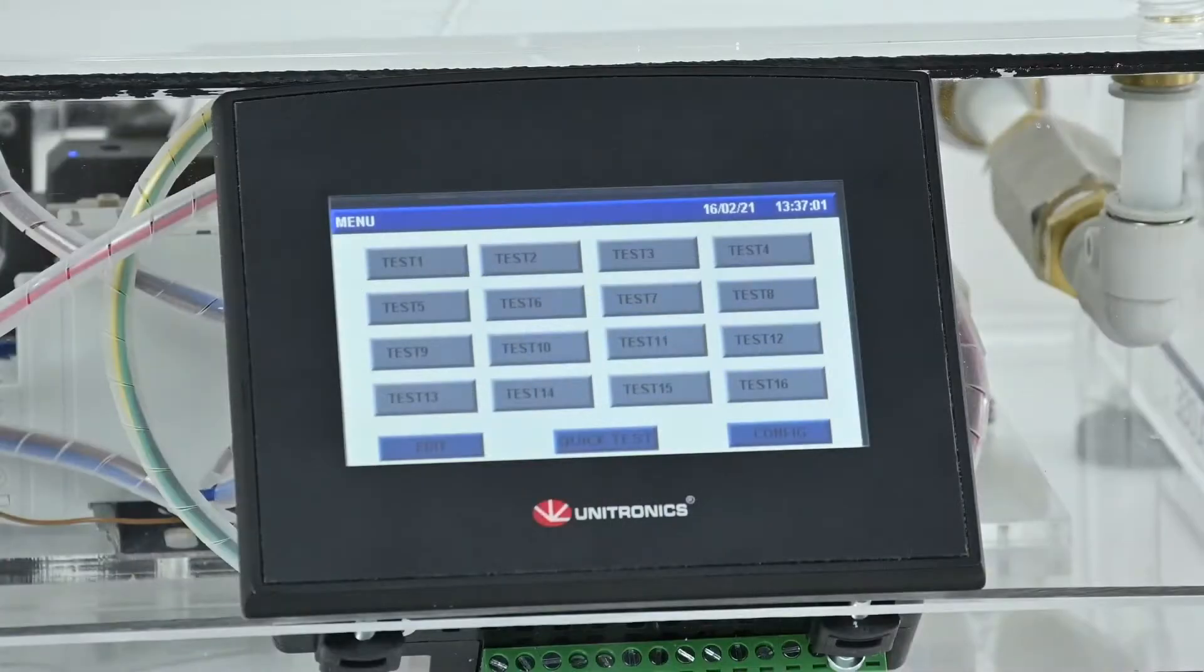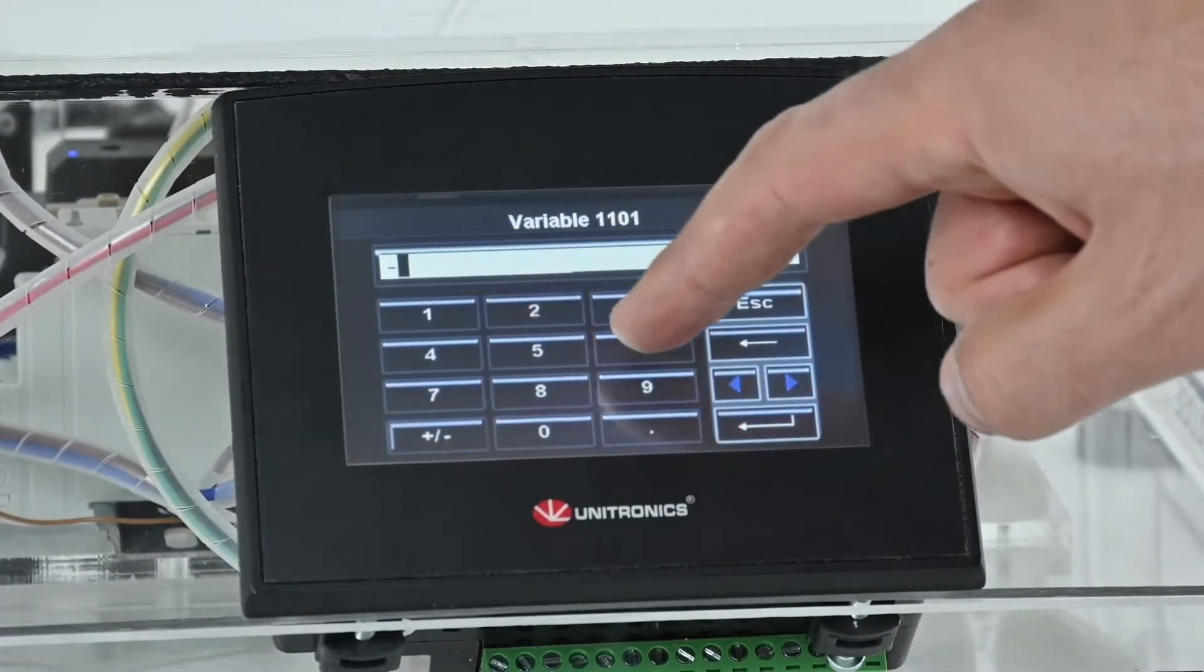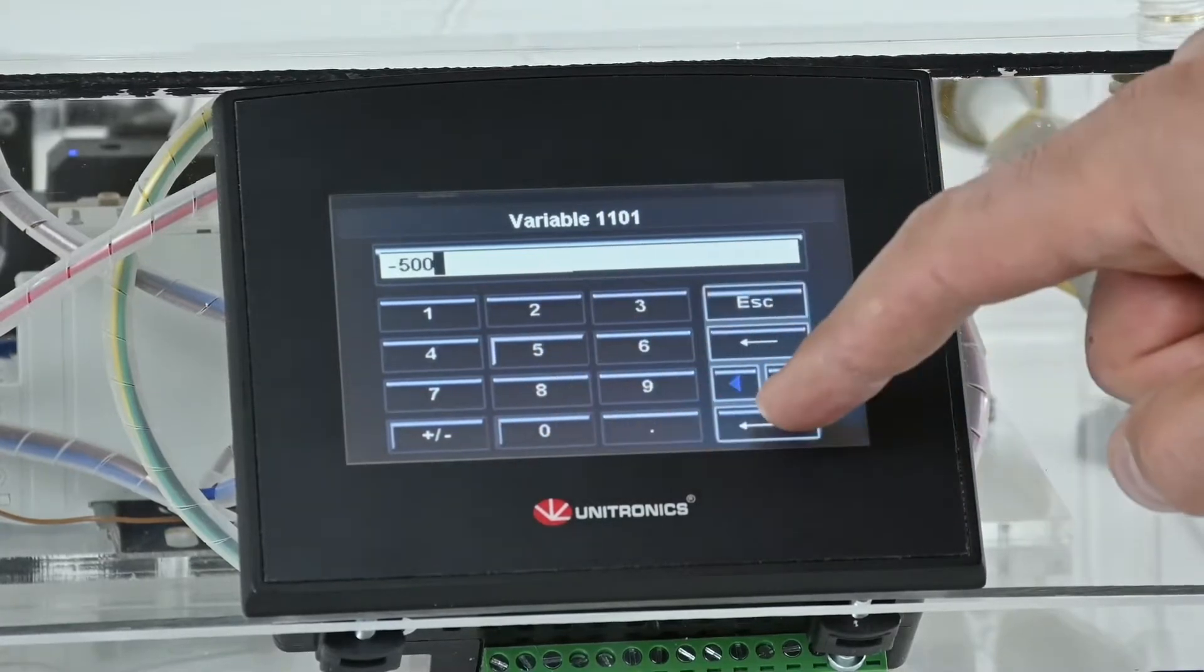Up to 16 recipes can be stored in its memory where the product name, vacuum level and cycle time can be programmed.